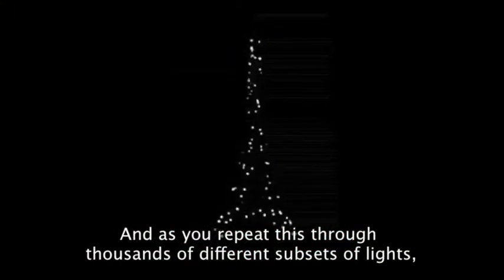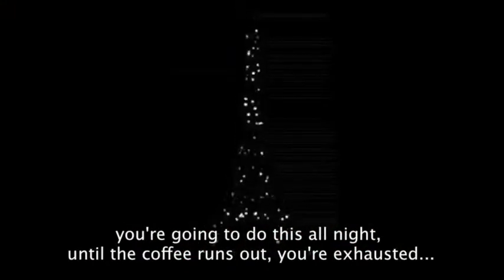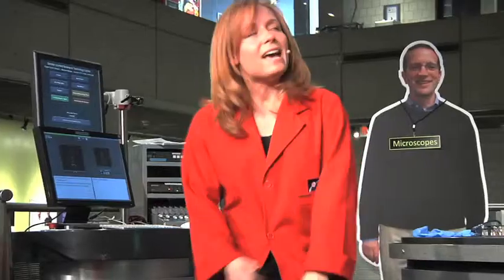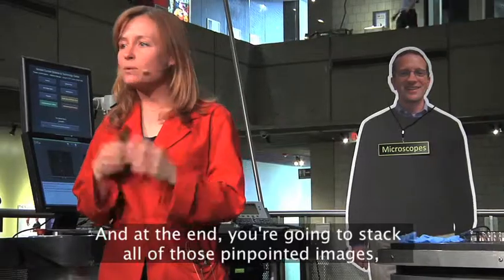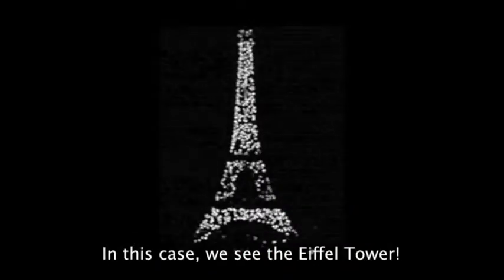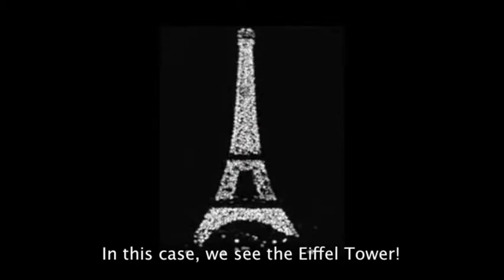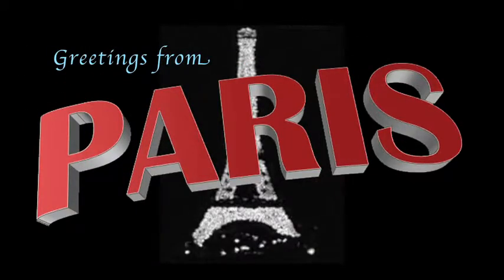And as you repeat this through thousands of different subsets of lights, you're gonna do this all night until the coffee runs out, you're exhausted. And at the end, you're going to stack all of those pinpointed images. Well, what do you think you're gonna see? In this case, you see the Eiffel Tower. You didn't know we were in Paris for this demonstration, did you?